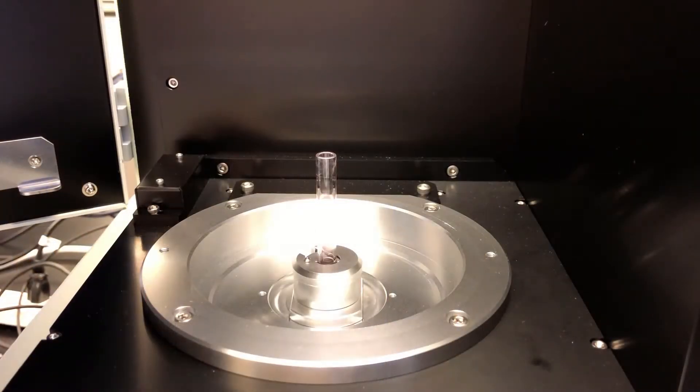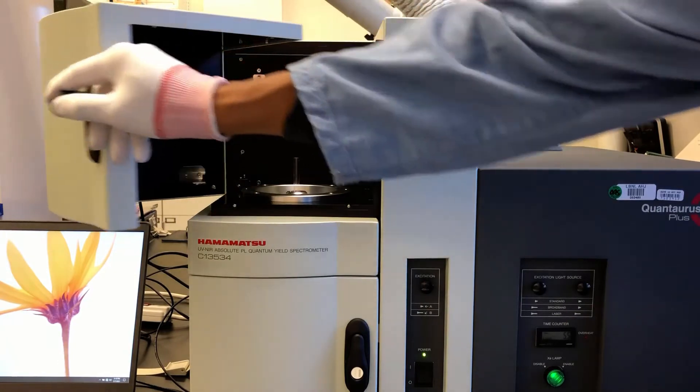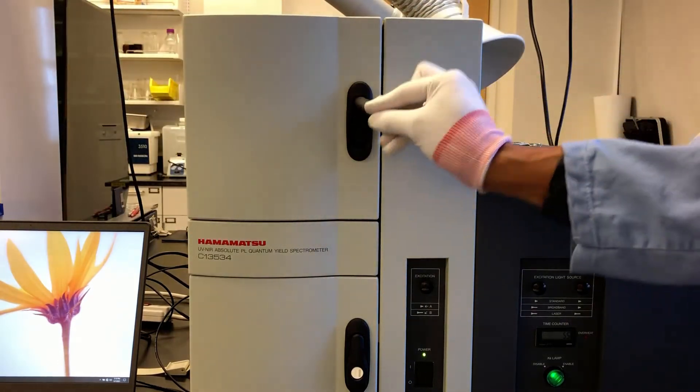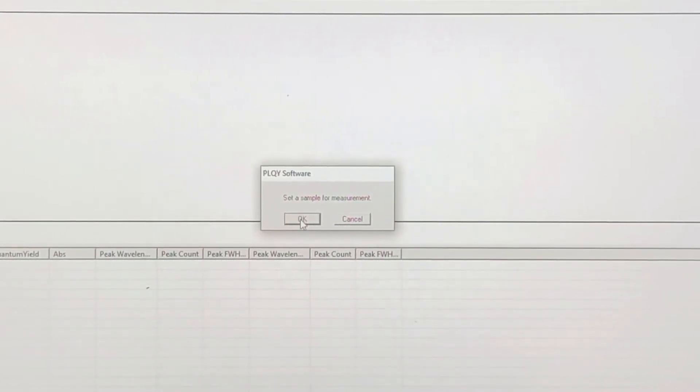Here's another view from inside the chamber. Remember to close the door or the software will not respond. Once you're ready, just click ok and the measurement will begin.